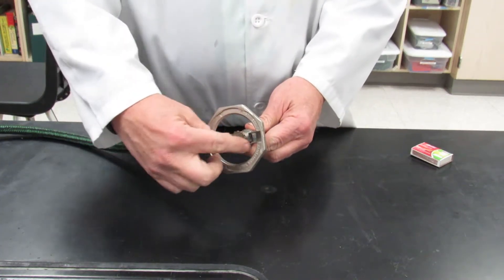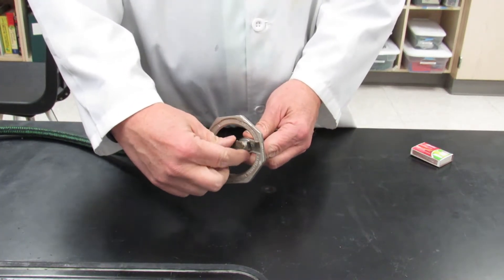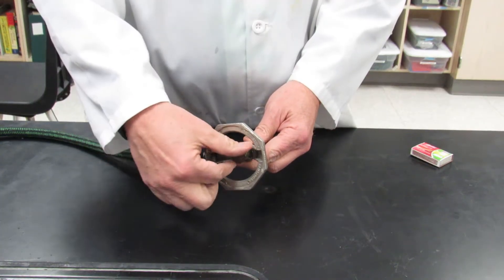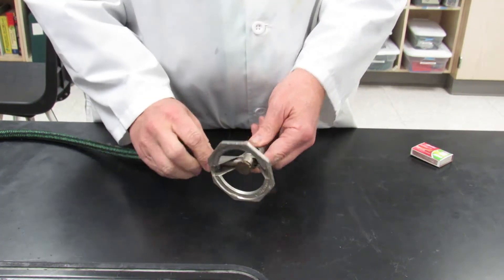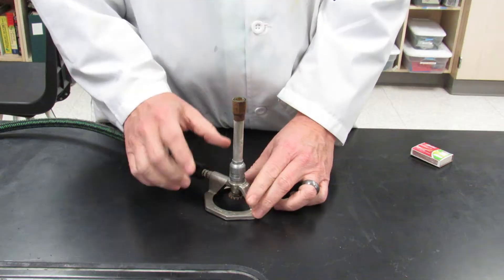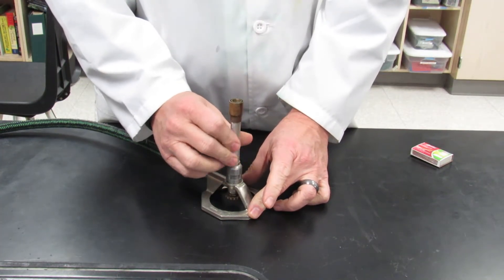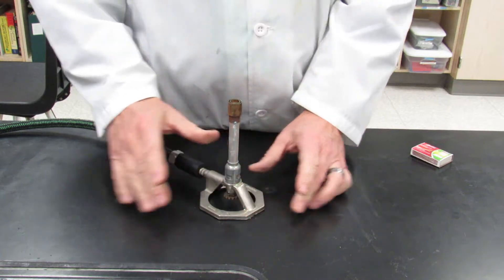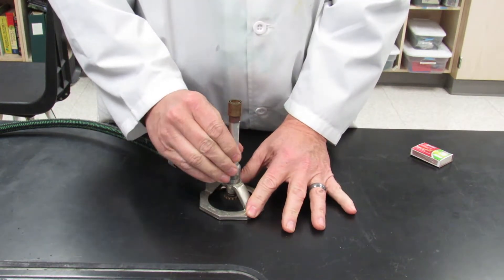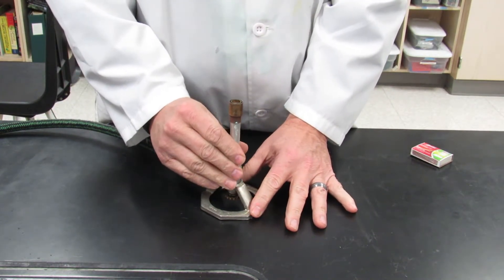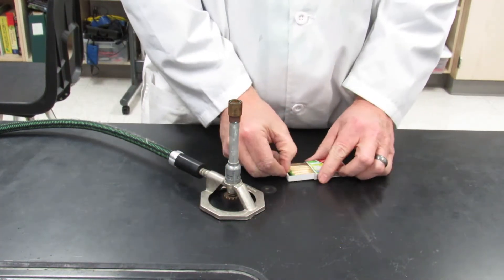When adjusting the Bunsen burner, take the valve on the bottom, which controls the amount of gas, turn it all the way clockwise, and then turn about a half turn counterclockwise. The barrel is also adjustable, so tighten that all the way clockwise until it stops. Make sure it's snug. Now it's time to light it.